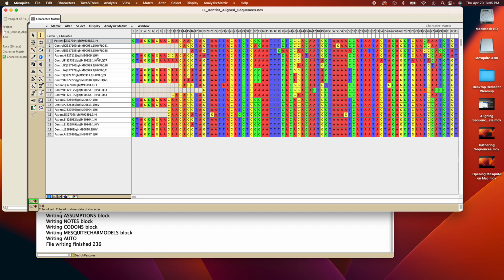You don't have to have all the different sequence information. One thing might be just to leave the patient letter as well as that accession number, one kind of easier way, so that in case somebody else is looking at this, they could go back into GenBank and grab that information. I think that might be a nice way. So something like this, patient D and the accession number. And so if you did that with each of these, then you would have nice clean data. So go ahead and clean those data up and then come back and we'll make our tree.